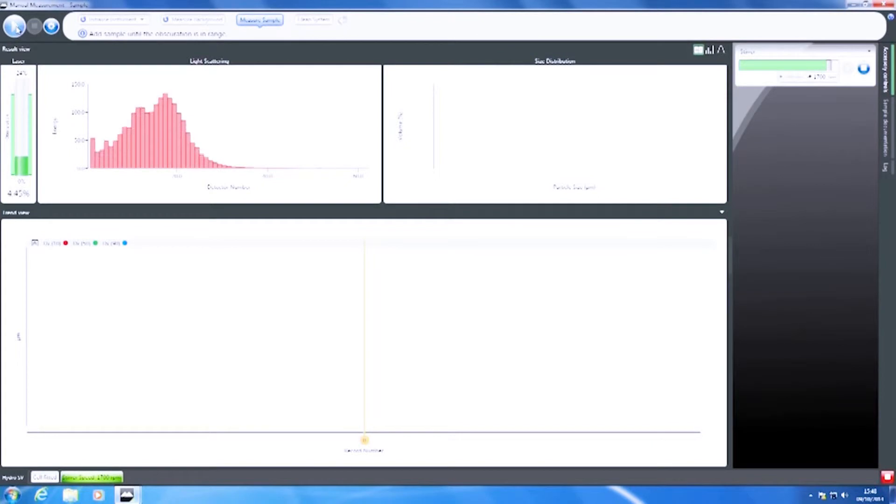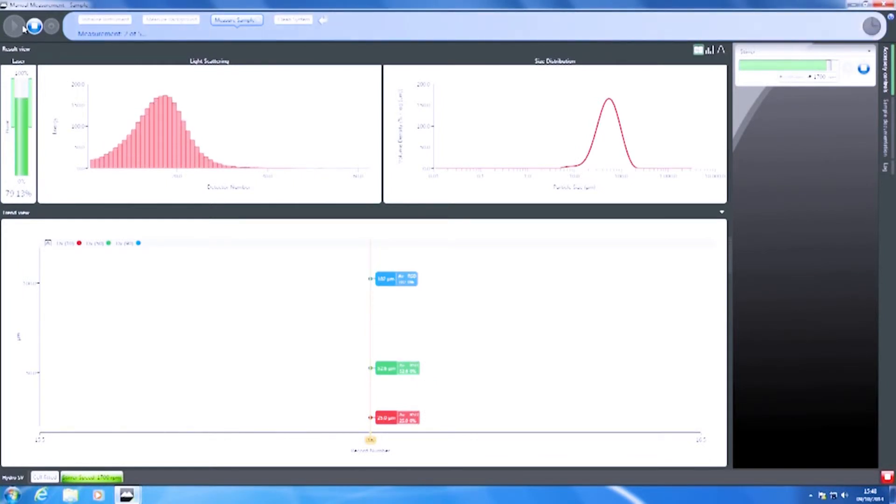And we're going to add some sample until we get the right kind of obscuration range. So, just drop a little bit more in. There we go. And then we'll start the measurement on the Mastersizer 3000, and I've set it up to do a few repeat measurements. That will let us make sure that the sample is nicely dispersed, that the results are stable, and we're suspending all the particles in the sample.